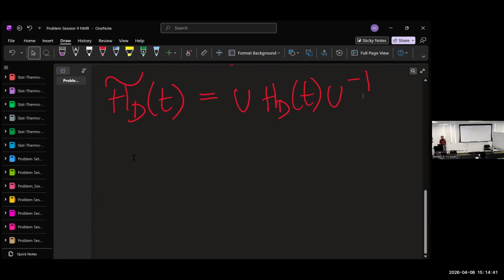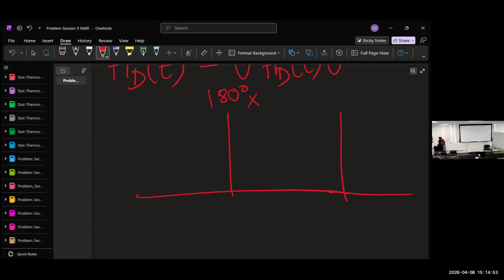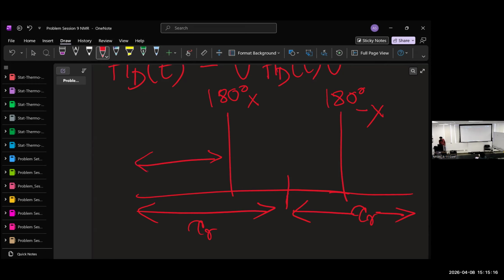The first sequence that you were given in class was called RFDR, and unfortunately, a lot of these sequences have different names. That pulse sequence looks something like this, although you can just truncate it here if you like. This whole distance covers 2 rotor periods, and you place the pulses at exactly half rotor period.